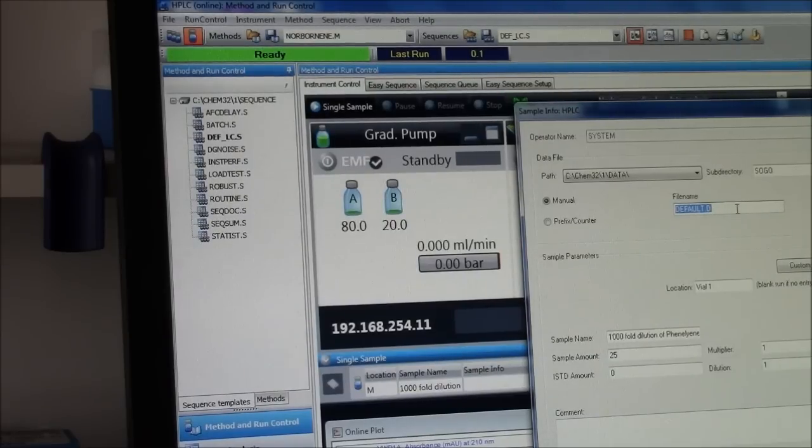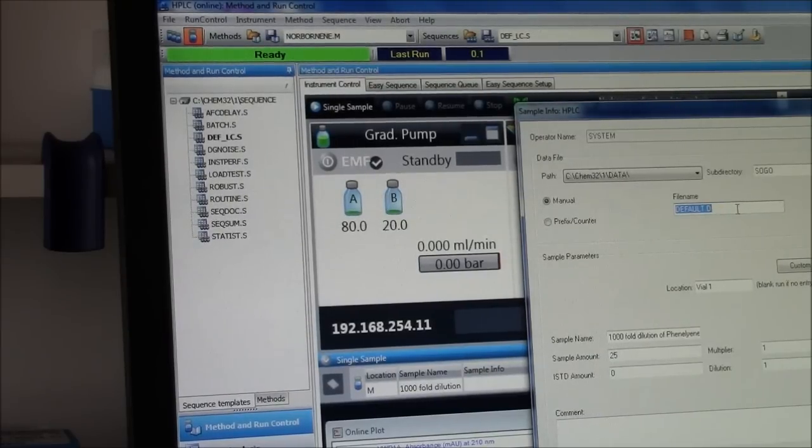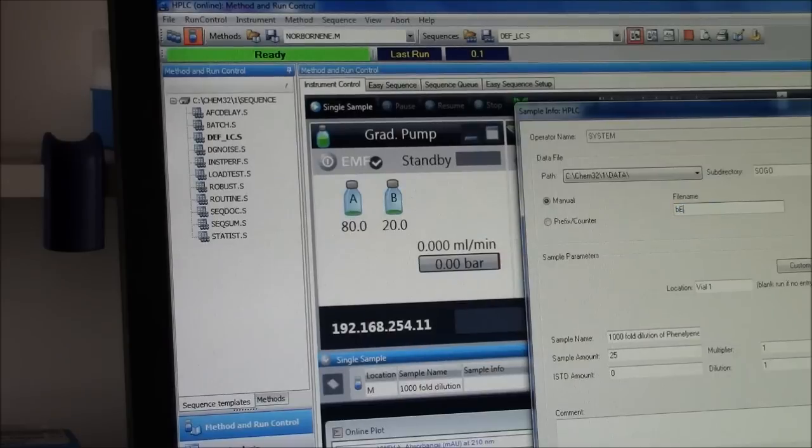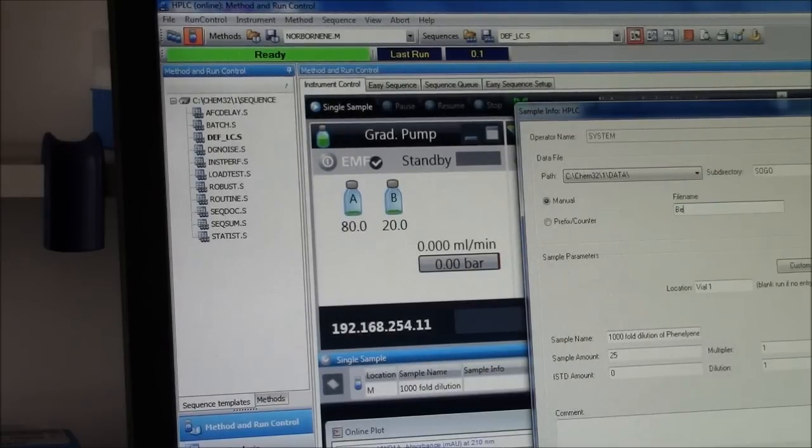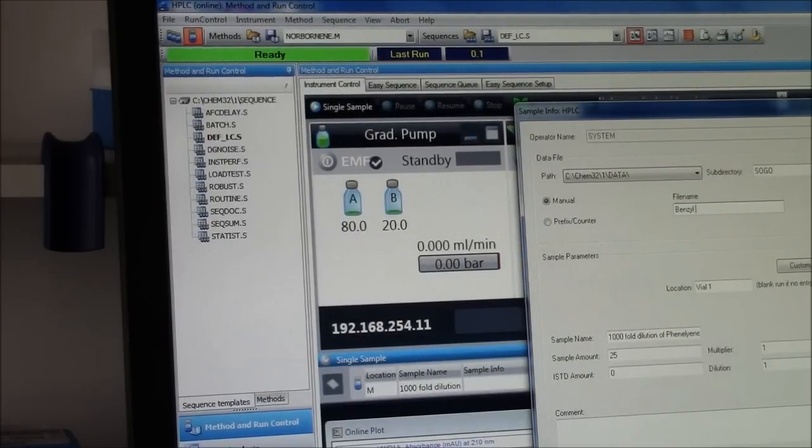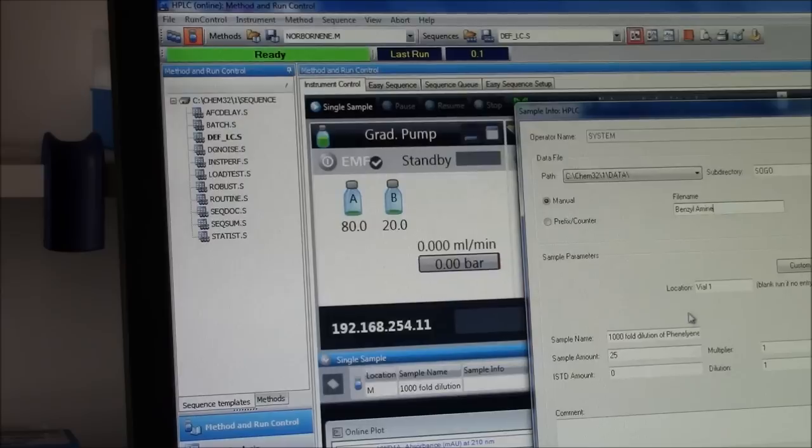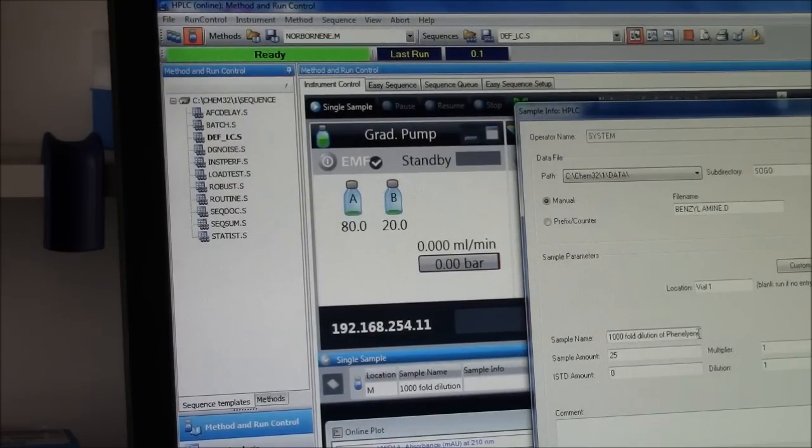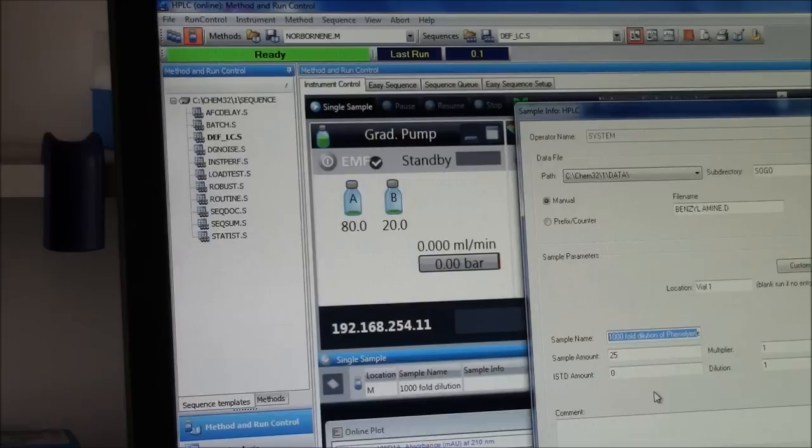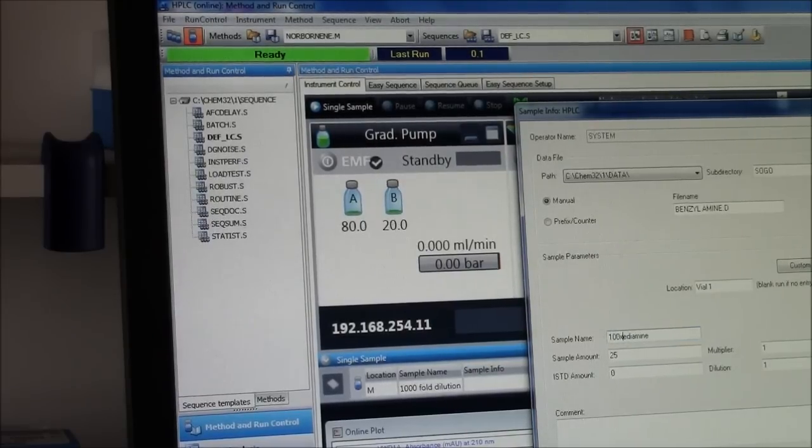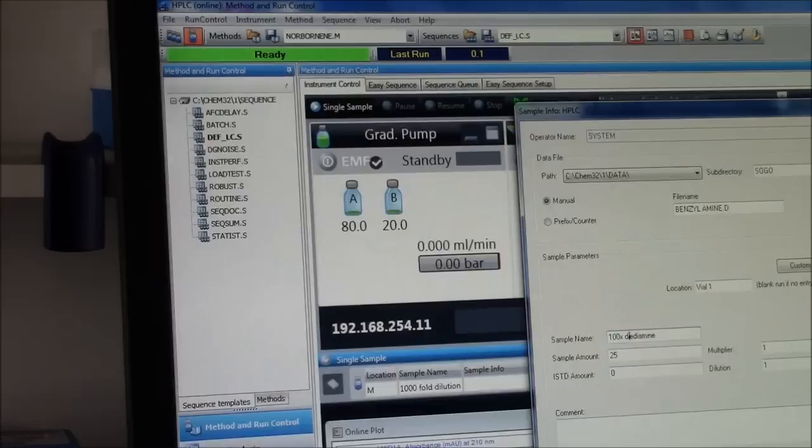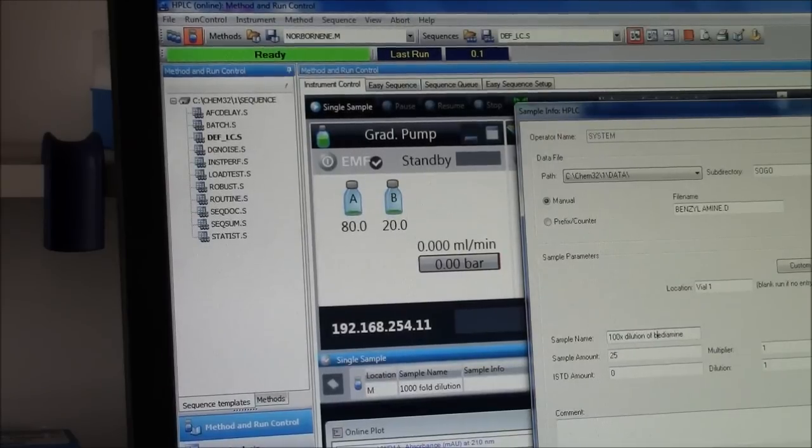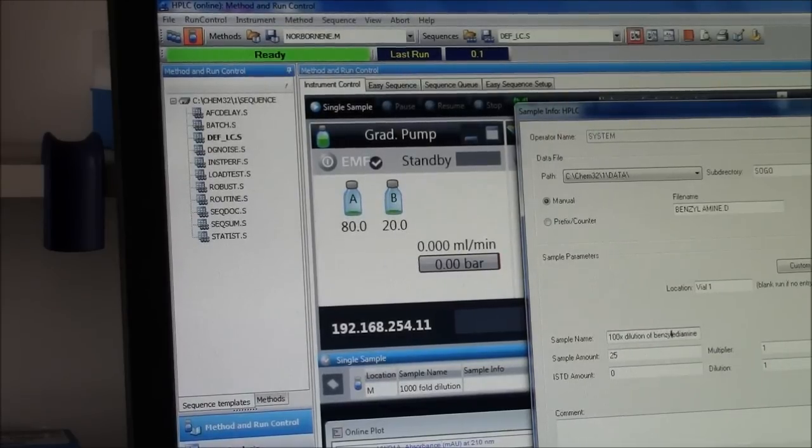I need to give it a file name. What is this sample I am running? It will be benzylamine. I can be more specific here. What is this actual sample? This will be a 100V dilution of benzylamine.